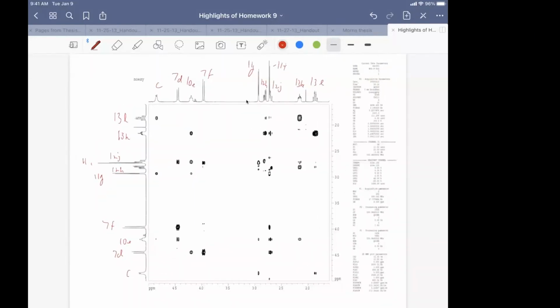And in this particular one, so the diagonal is negative, and in this one, we didn't plot it. Now James is probably going to plot our diagonals as dotted lines to show it's on the other side in the NOESY. But here we simply left it blank.